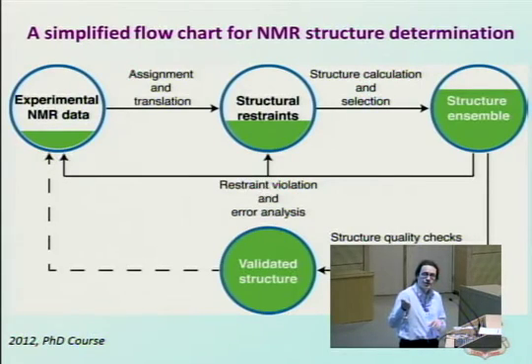So we do have some facilities to automate the step of NOESY cross-peak assignment and therefore the production of structural restraints, but today we just assume that structural restraints have been, let's say, manually produced, as actually is still the case for the majority of structures that have been determined today.